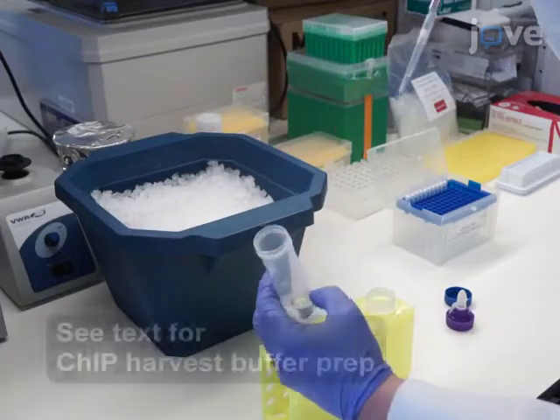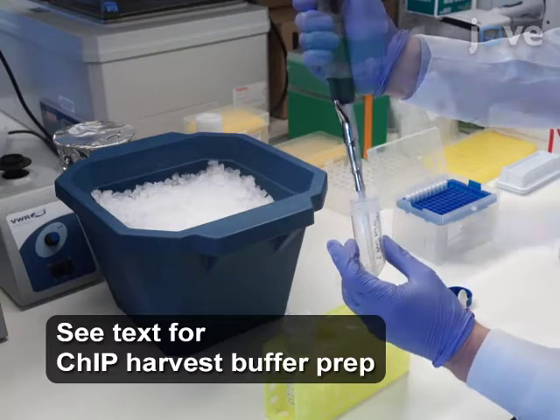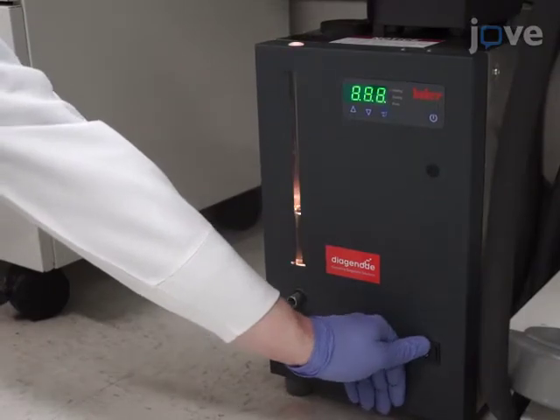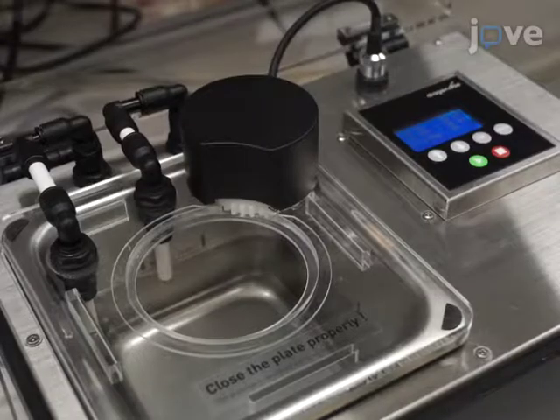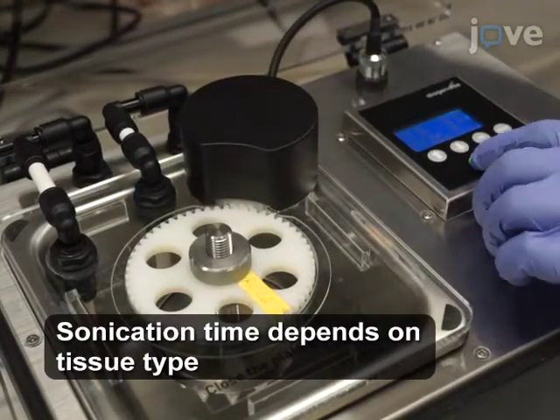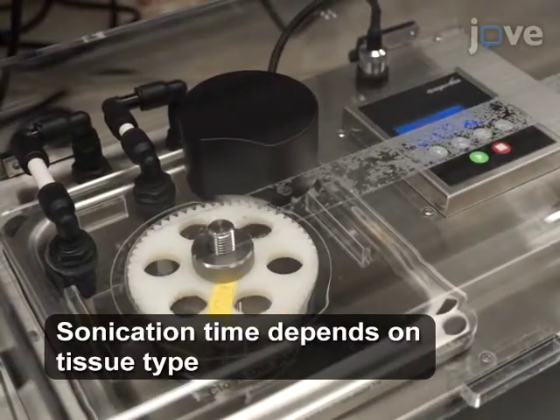Add 300 microliters of ChIP harvest buffer with protease inhibitors per 50 mg of tissue and lyse the samples for 30 minutes on ice. While the cells are lysing, turn on the water bath disruptor and associated cooling system and allow the temperature to reach 4 degrees Celsius. Place the sonicator tube in the water bath disruptor and sonicate the melanoma tissue for 60 cycles at 30 seconds on and 30 seconds off to obtain chromatin fragments of 200 to 600 base pairs.